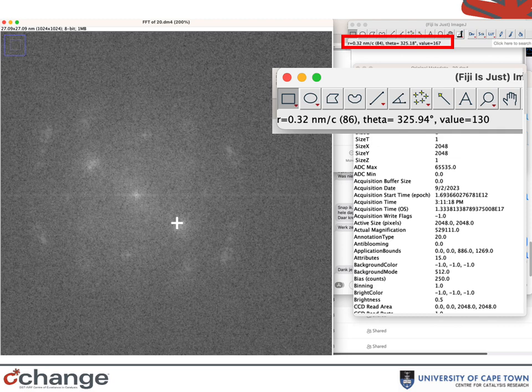Another way to do this is to draw a circle, and to make sure that the circle is concentric around that cross of these 2 horizontal and vertical lines, and make sure that your circle exactly overlaps multiple diffraction spots. That might increase your accuracy a little bit, but it also costs a lot more time than the method I've described here.